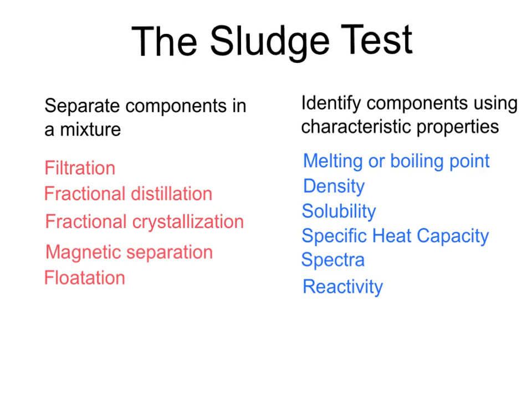You can check to see if your substance melts, but keep in mind our alcohol burners only get up to around 300 degrees Celsius, so if the melting point is above that, you're not going to see anything. And we don't have the proper equipment to determine exact melting point. We do know how to find boiling point, though, of a liquid, so you can do that.